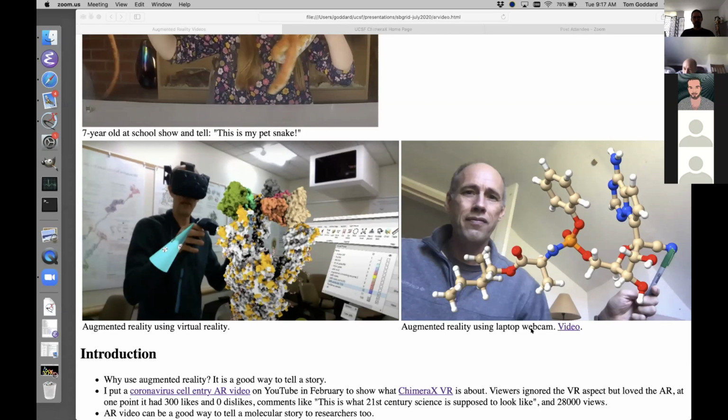Yep, this is a huge problem with VR. Now, if we take away your keyboard and your mouse, it's really hard to get anything done. And so I would say that virtual reality is still not a high productivity tool. It's an interesting thing to use. And I think in the future, when there are better user interfaces that can make up for not being able to type on the keyboard, it will become more useful. But I don't have a solution for that.